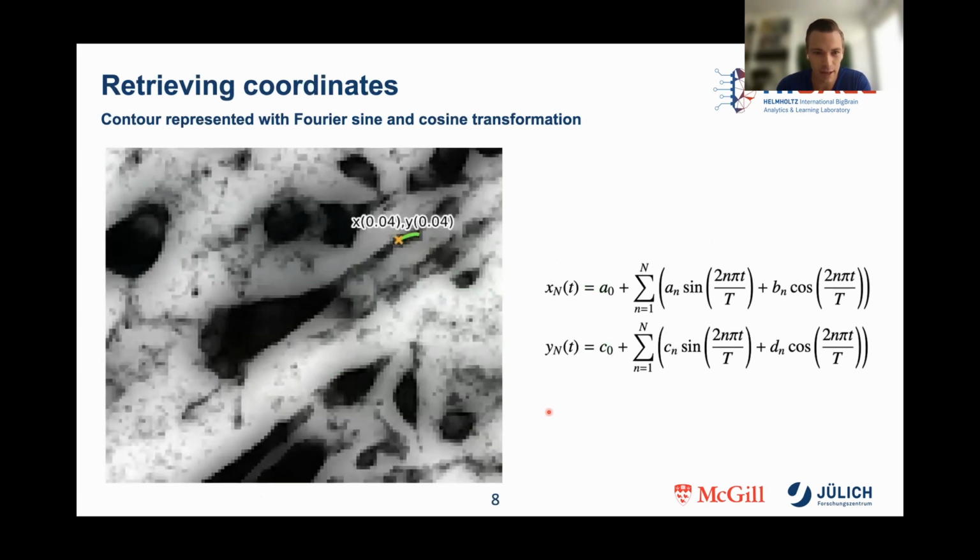So this is an example. Here we sample coordinate by coordinate, and can see that the network learns how to draw the outline of a cell. Luckily, what happens here sequentially, for illustration, happens in one single computational step in practice. So this is really efficient.